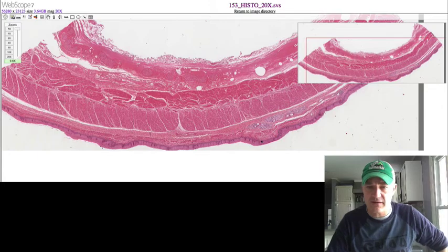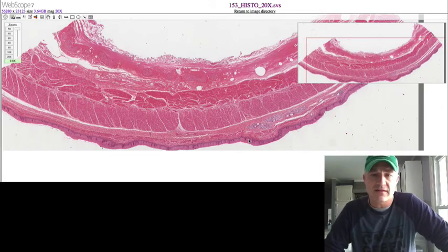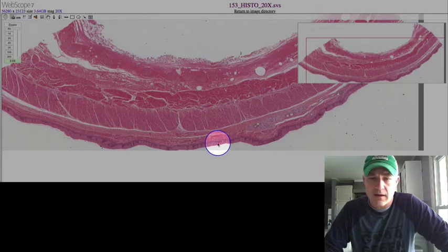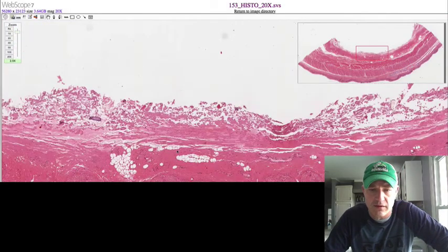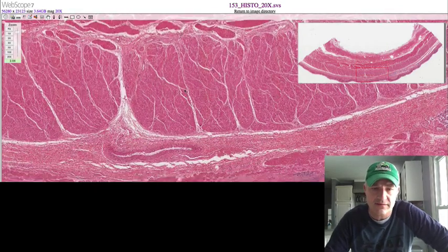Here's the esophagus. Again, this one, for some reason, they have the image upside down. Doesn't always help us on this one here. But if you're looking at this one, we can see a few of the main layers right away here. You can see the epithelium along the bottom right here. We can see definitely that muscularis through the region right here. That adventitia to be here. And then what we'll do is we'll take a look and zoom in on this a little bit more, look at some of the more distinct layers here.